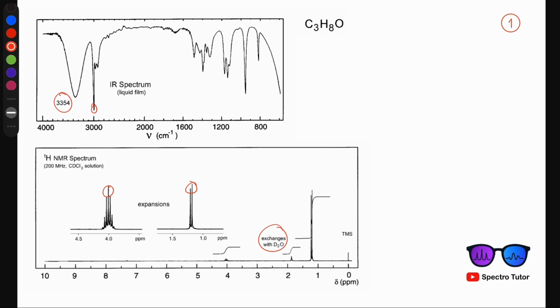So that's the general way we'll approach compounds in this channel, and let's start by applying this method to our very first example, as you can see here, C3H8O. Like the way we talked about it before, we're going to start by calculating the IHD number, but before calculating the hydrogen deficiency index, I need to explain a little bit what it tells you.